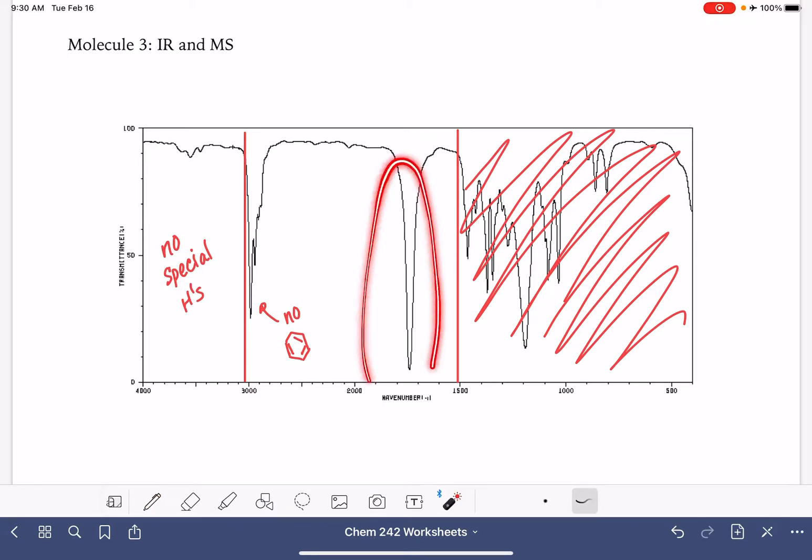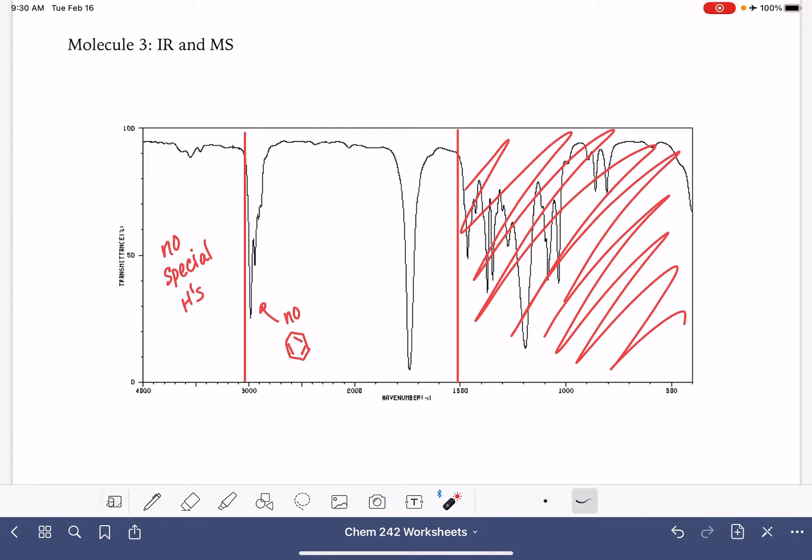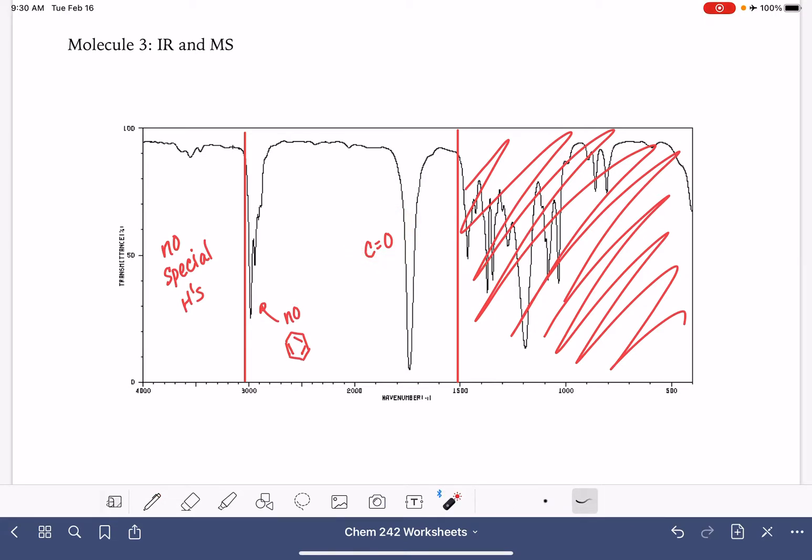This is a peak that's impossible to miss, showing up at around 1,700. This is our carbon-oxygen double bond. We're going to want to keep that in mind when we're working on our molecular formula that we do have an oxygen atom in this molecule.